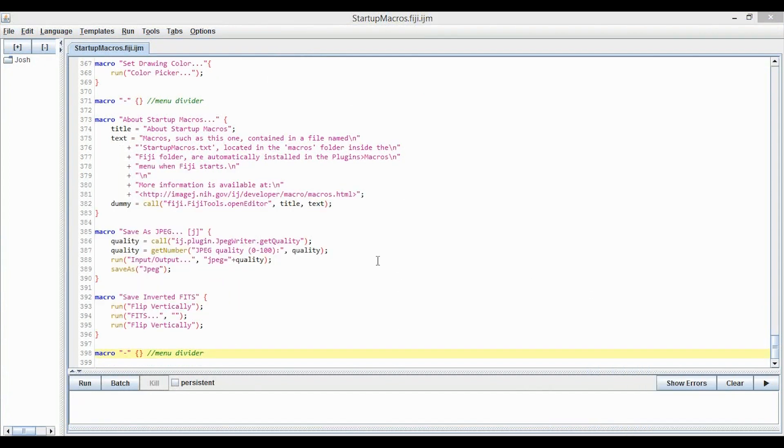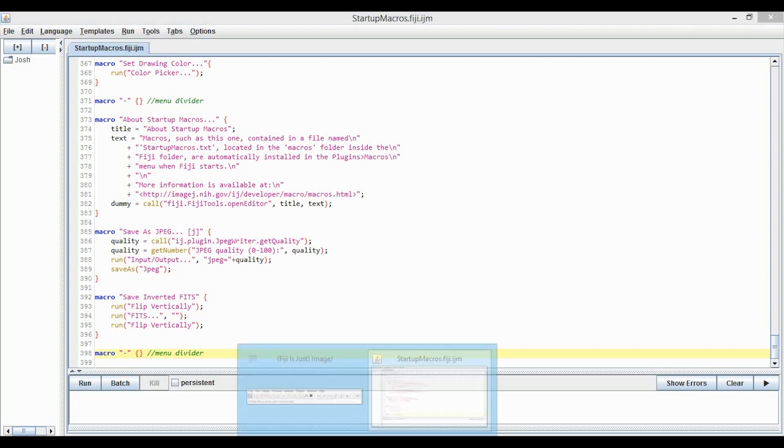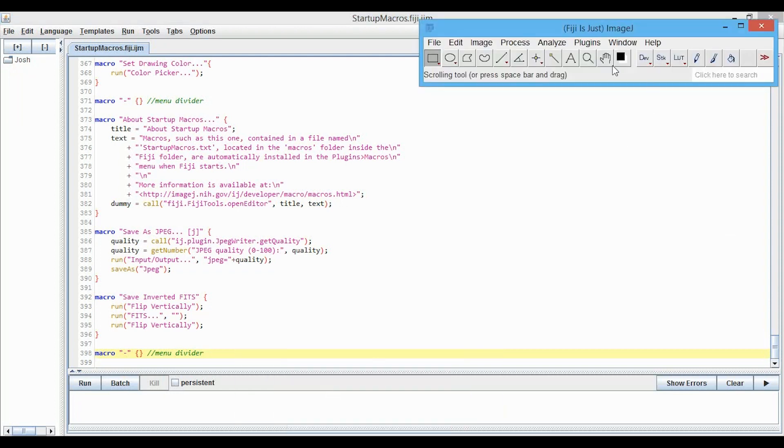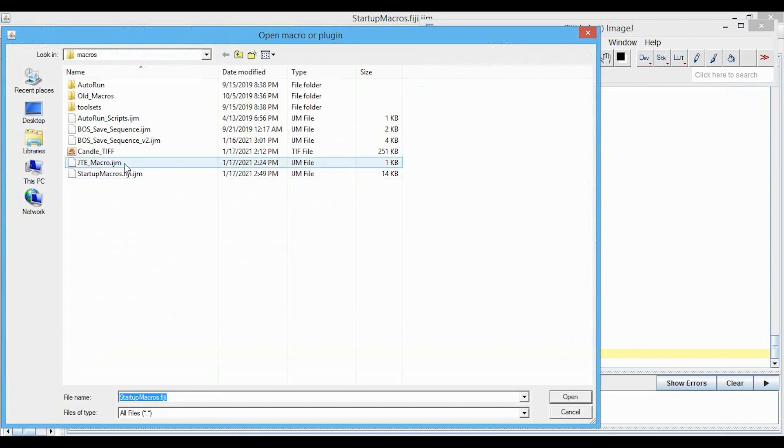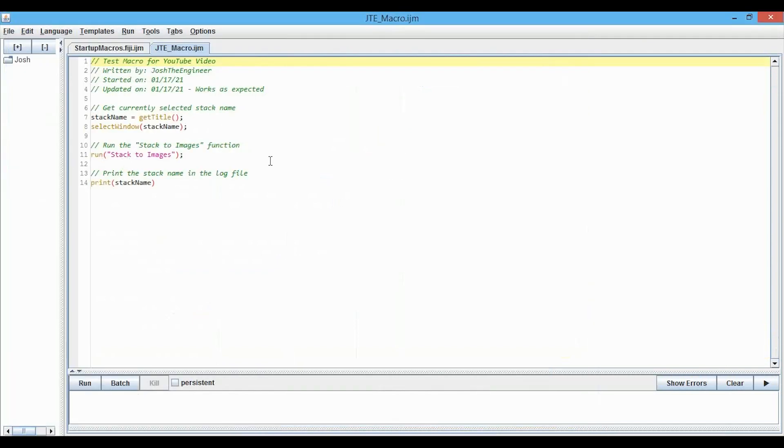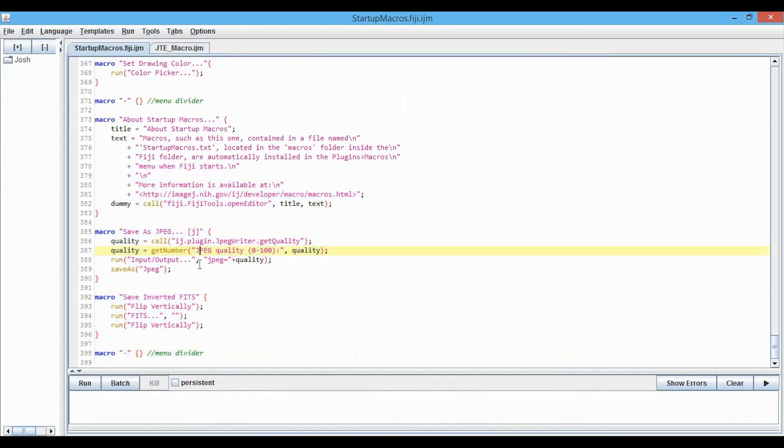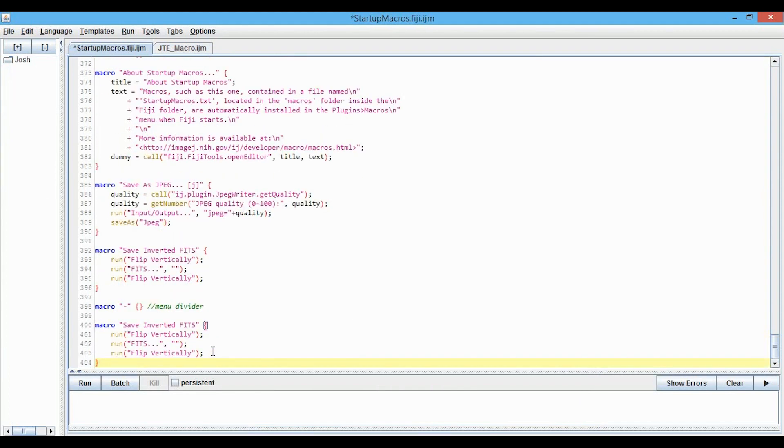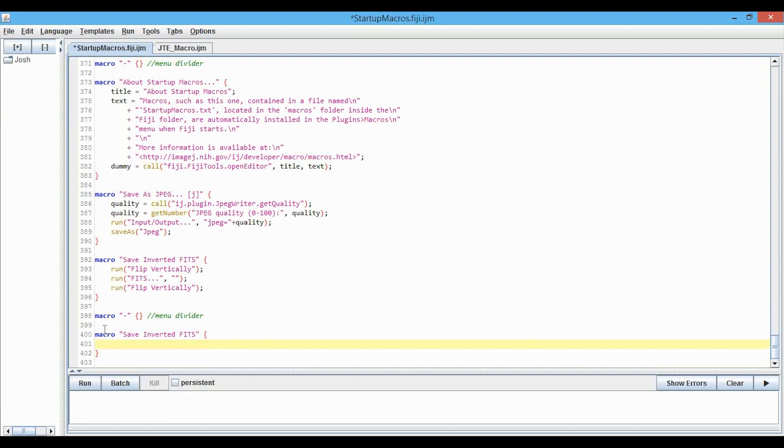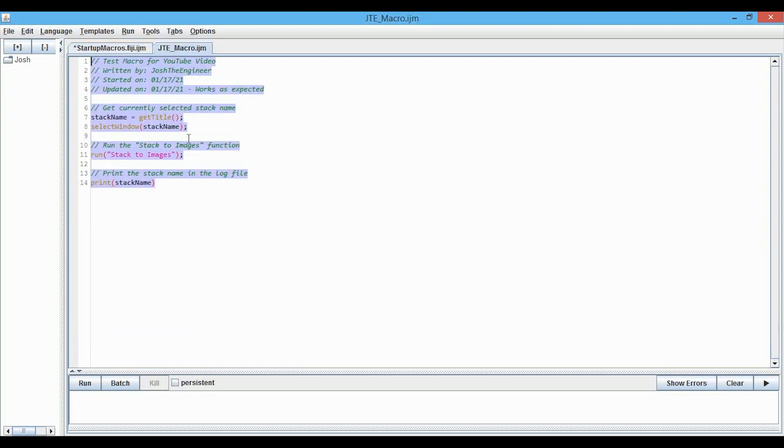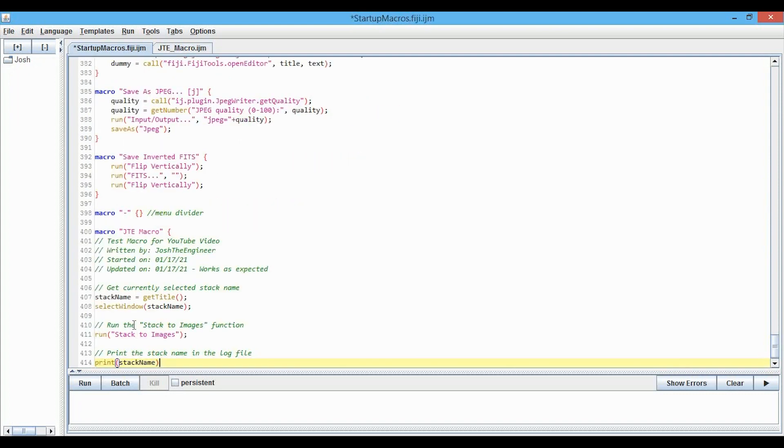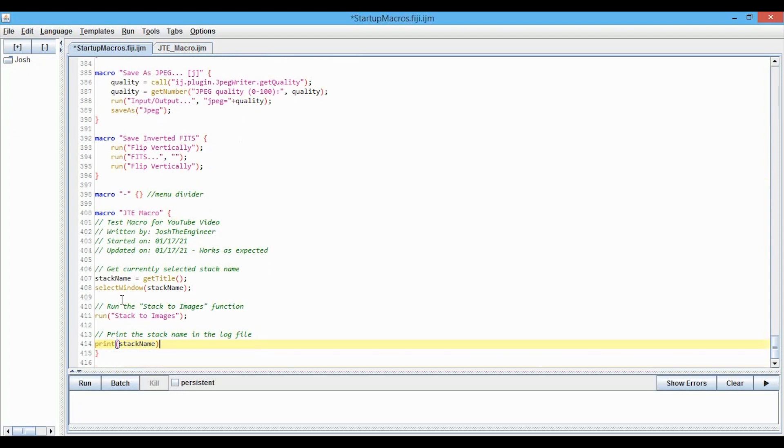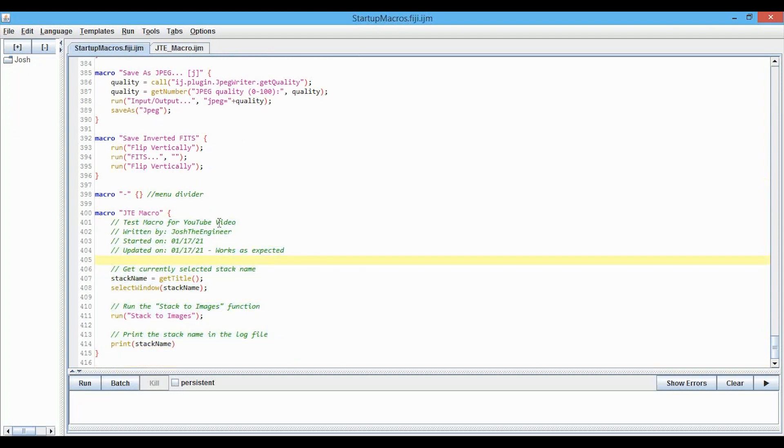Now we're going to add our macro code, so I'm just going to go back into here. We'll go Plugins, Macros, Edit, open up the JTE Macro. First I'm going to copy this, and I'll just add this down here. We don't need what's in here, we're going to call it JTE Macro, and then I'm just going to copy all this code, put it in here, and I will tab to make it easy to read, save it.